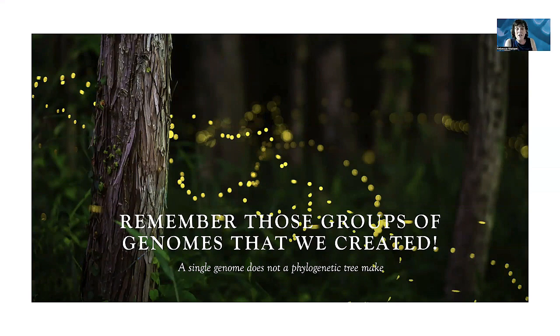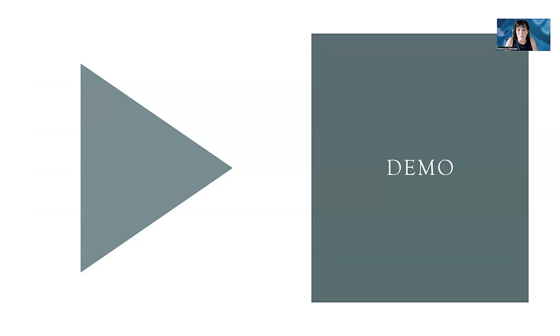Remember those groups that we created? A single genome does not make a phylogenetic tree. Sometimes it's really hard to find things to compare, or you can't figure out what to do. So I tried to show you in the last episode easy ways that you can sort through data and find that. This is so exciting. Let's go build some trees.